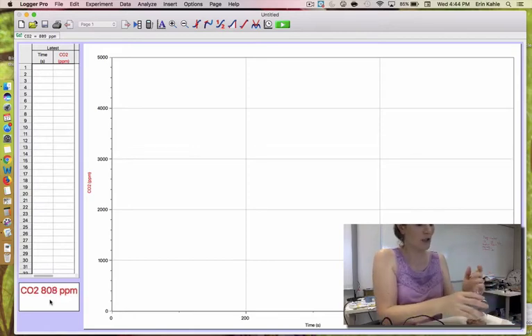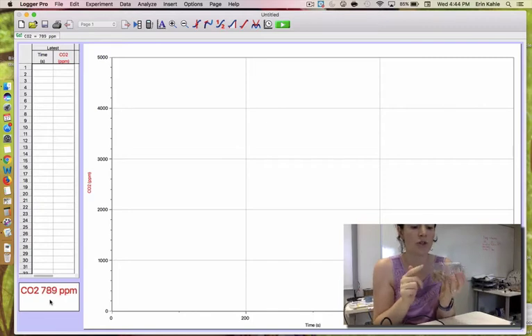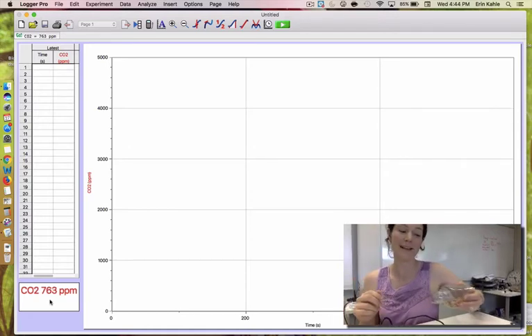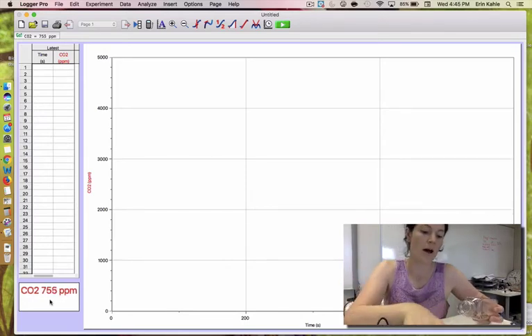Obviously you're going to count them out because you're trying to control the number of beans, since you're going to do the same thing 6 times. But you might also want to take the mass of your beans, because if you get different values, it might turn out that 30 beans have different masses. So you might want to take the mass so that you can figure out a rate of cellular respiration per gram of bean or something.